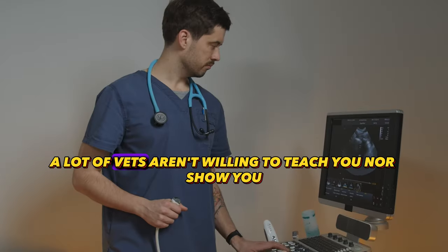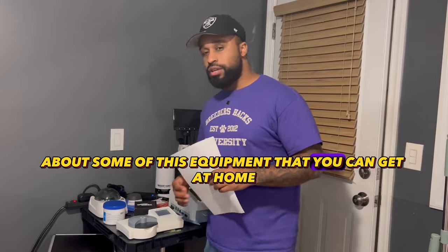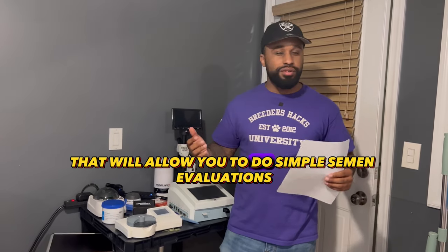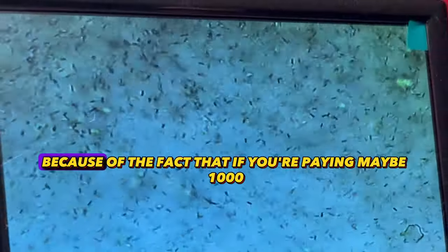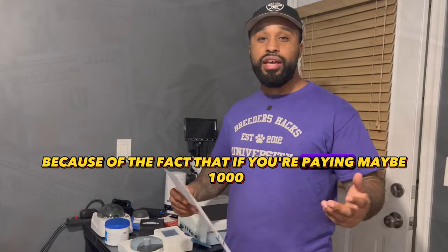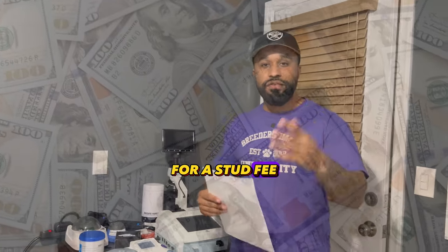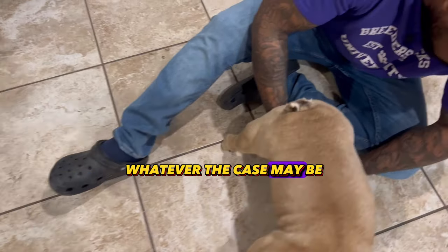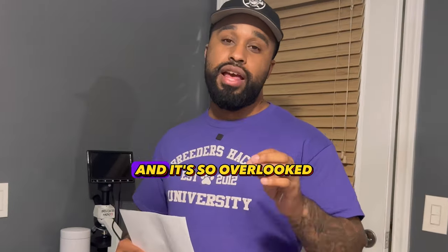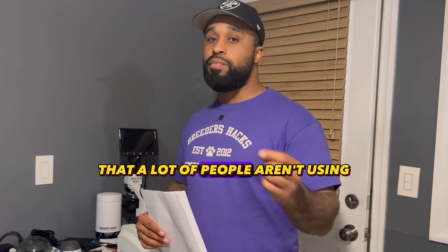A lot of vets aren't willing to teach you nor show you about some of this equipment that you can get at home that will allow you to do simple semen evaluations. A semen evaluation is so important because if you're paying maybe $1,000, $5,000, $10,000, I don't know, for a stud fee, whether they're shipping you the semen, whether you're doing the breeding in person, whatever the case may be, it's super important and it's so overlooked. And I'm going to show you guys some stuff right now that a lot of people aren't using here in the United States.